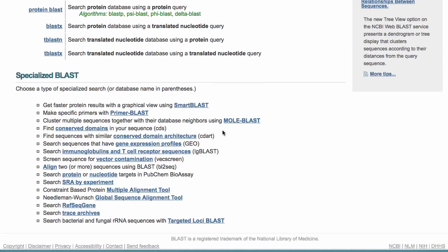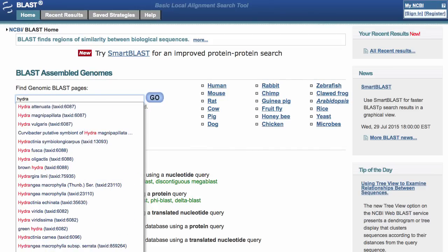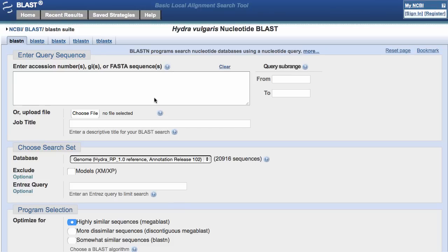These links have to do with some BLAST variants or alignments. Now, back to the top of the page — I'd like to search the genomic dataset at the NCBI for Hydra vulgaris. All I have to do is start typing 'Hydra' and I get a number of choices. I can select Hydra vulgaris, and then I type 'go'.